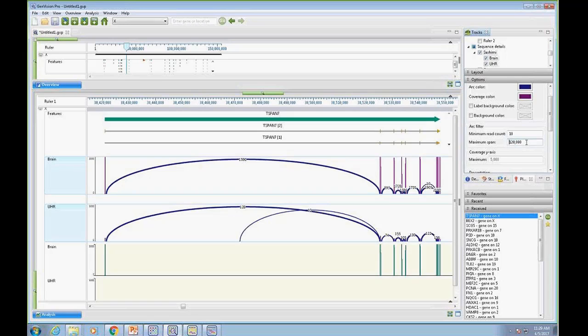something with my webinar is fighting me on this window, but I'm going to have to see if I can get it to go here. No, we're having a WebEx struggle for my window here. Let me see if I can get this to add. No, I can't with the WebEx running. Unfortunately, I can't click that. Sometimes the webinar will block a certain box like that, but I can change that number.